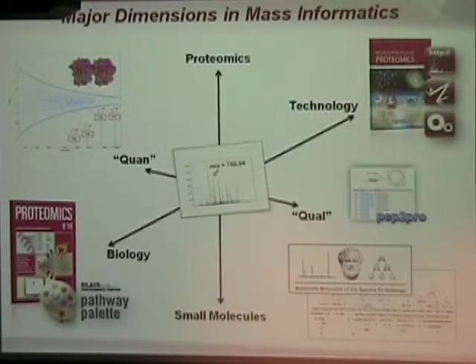One of the challenges has always been, how do you represent the information? How do you make a report of all of this that brings a little bit of relevant biological context? Because the typical report is a list of peptides and a list of proteins. So I'm going to try and demonstrate a web-based tool which allows you to give a kind of report to your collaborators, and we'll see how this works, because this is live.